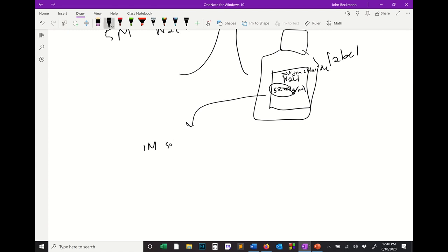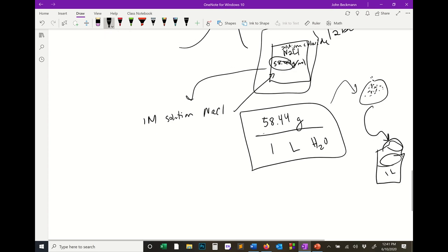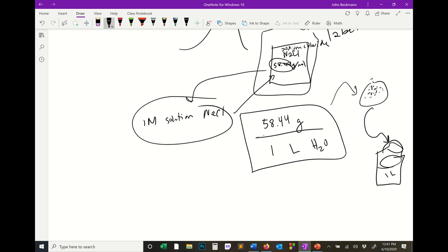A 1-molar solution of sodium chloride would be exactly that number, 58.44 grams per 1 liter of water. Now, it's not always going to be water as your solvent, but in sodium chloride, for sure, it'll be water, okay? So this combination, putting literally on a weigh boat, measuring out 58.44 grams of sodium chloride, and then putting that into a bottle with 1 liter of water would give you a 1-molar solution of sodium chloride.